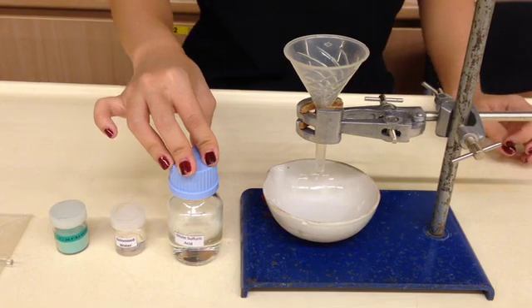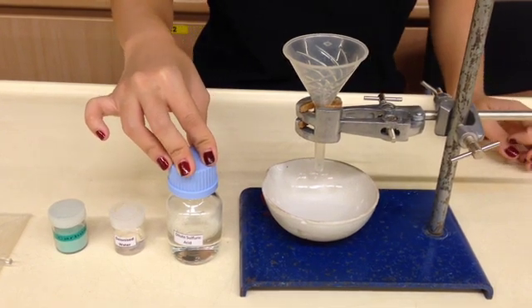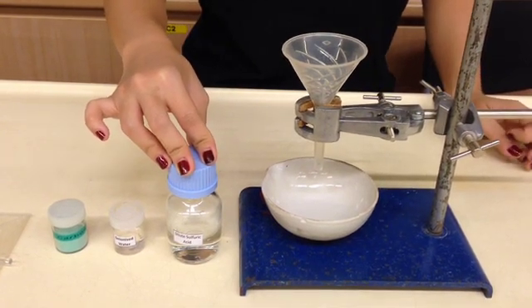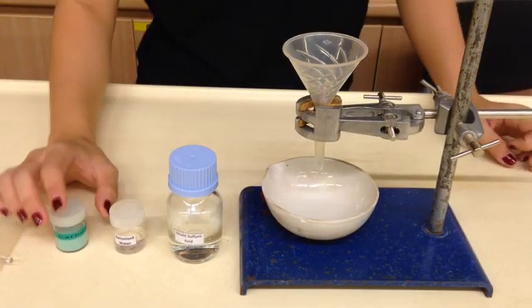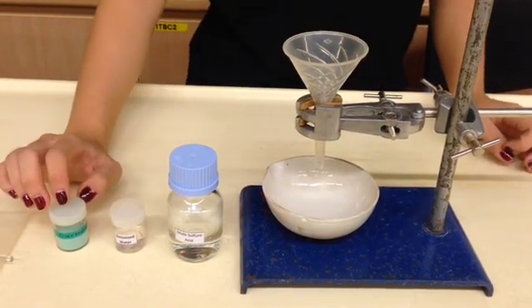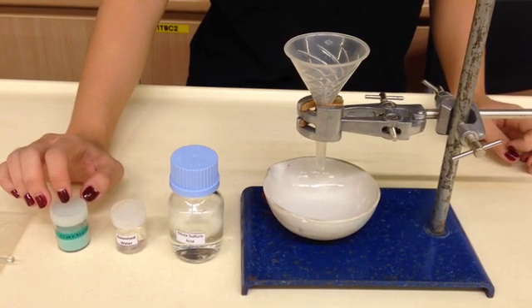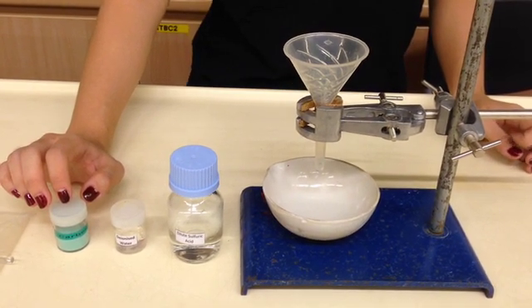So whenever we are preparing a soluble salt, we can use this method of adding excess of an insoluble reactant to an acid. So today, since we want to prepare copper 2 sulfate, we need something that contains copper 2 ion, as well as something that contains sulfate ion.